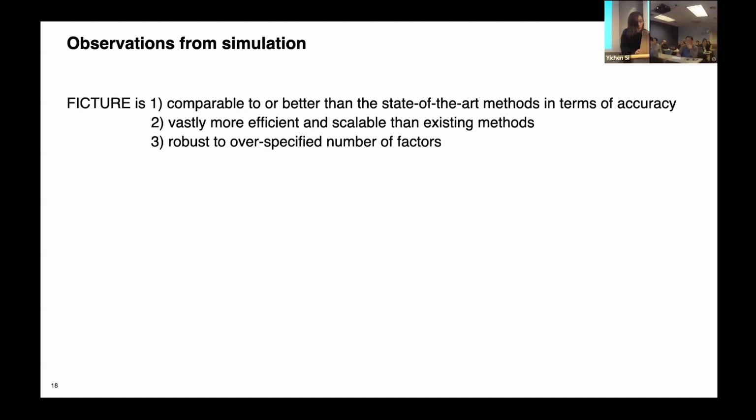Another online question. A question from Fan: is the error rate stable among different cell sizes? That's a great question. We haven't evaluated that, but I have some impression from the real data that it's not really the cell size, but how similar your neighbors are to the cell.